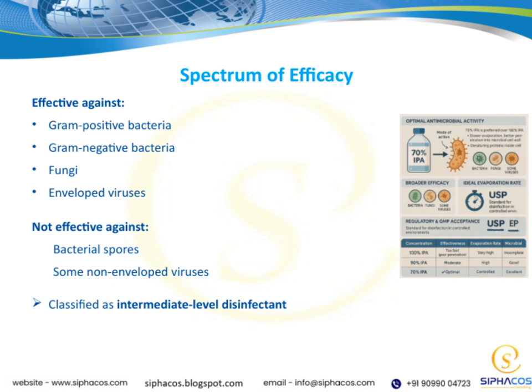This means it offers a good balance of efficacy for many common pathogens, but may not be sufficient for sterilization or for highly resistant organisms. Understanding these distinctions helps us choose the right disinfectant for the specific needs of each situation, ensuring safety and effectiveness in infection control.